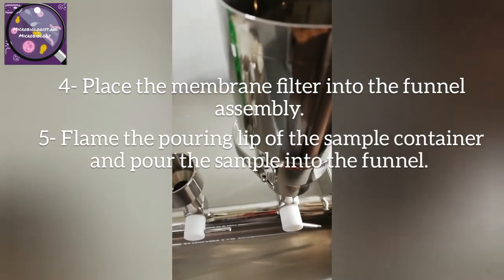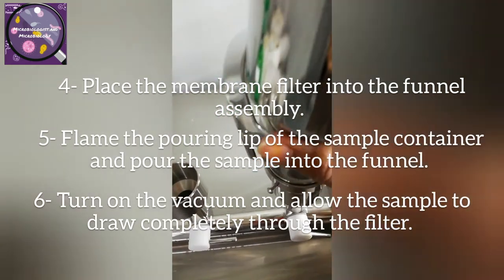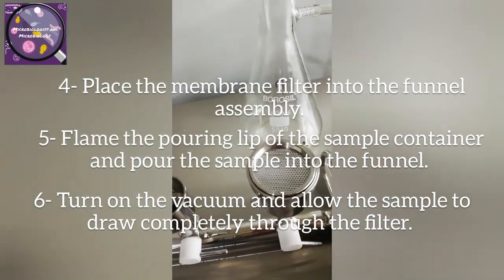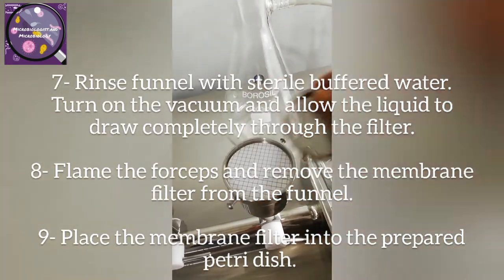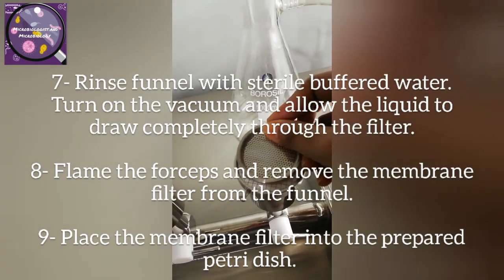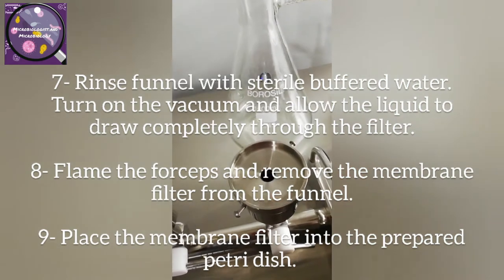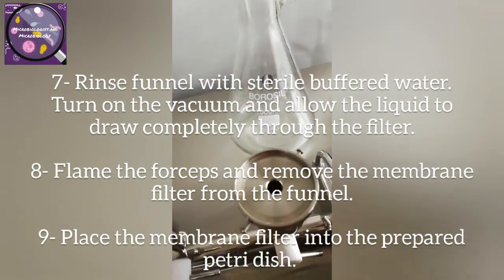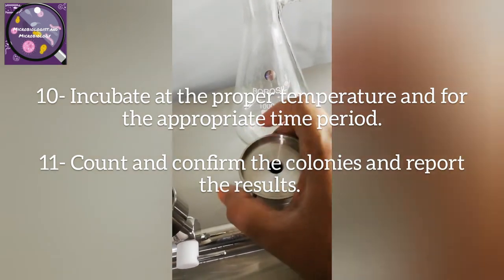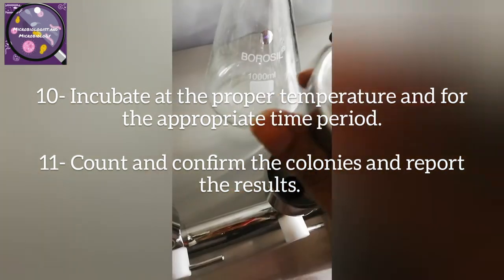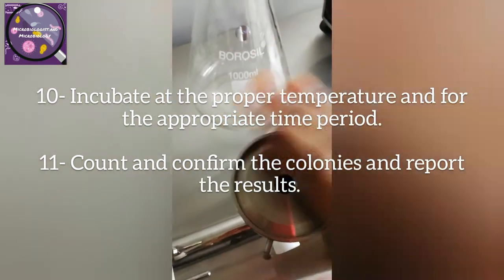Flame the pouring lip of the sample container and pour the sample into the funnel. Turn on the vacuum and allow the sample to draw completely through the filter. Rinse the funnel with sterile buffered water, turn on the vacuum, and allow the liquid to draw completely through the filter. Flame the forceps and remove the membrane filter from the funnel. Place the membrane filter into the prepared petri dish, incubate at the proper temperature for the appropriate time period, then count and confirm the colonies and record the results.